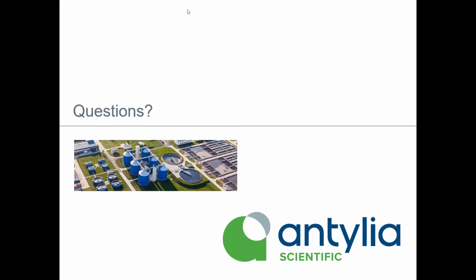I would mention that a lot of the potable water plants are going to automation. As I mentioned in that overview of a typical potable water plant, their treatment process, a lot of that is becoming automated with process analyzers. The inflow to a plant, they'll measure pH, they'll measure flow. Obviously, you can't let the flow exceed a certain amount, or you'll overcome the capacity of the treatment plant, which would be bad.